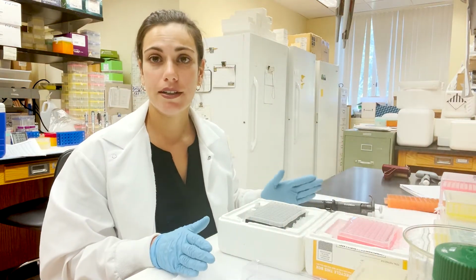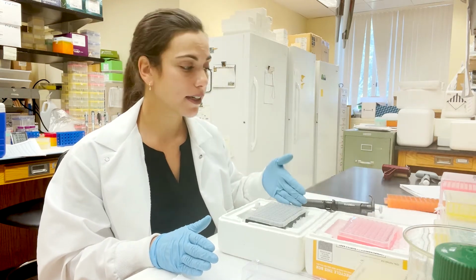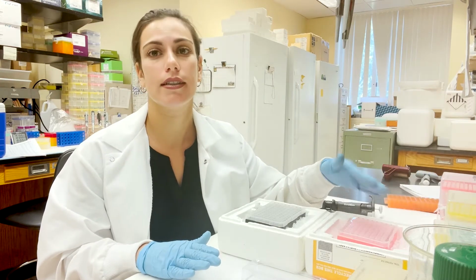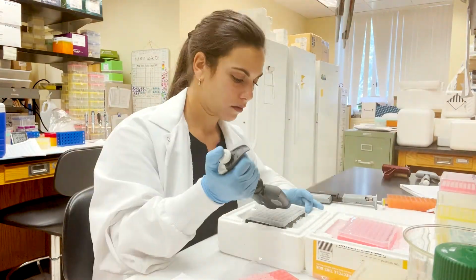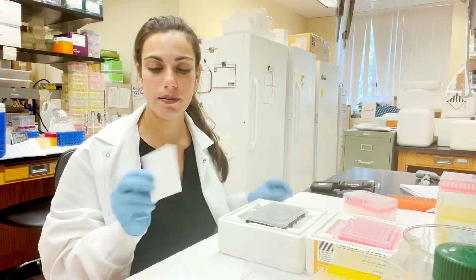And now I add my genomic DNA. I have to change tips every time because each sample is different. I like to use filter tips for this just so that it doesn't risk contaminating my original stock DNA. Then we seal the plate with a microseal.